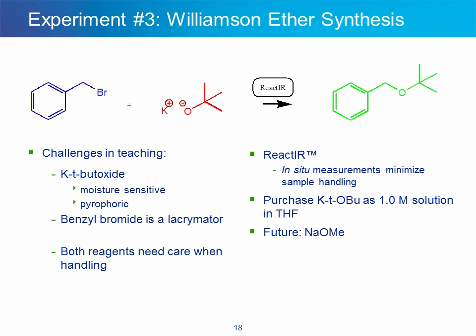Our approach to studying this reaction in the teaching laboratory is by using the ReactIR, because in situ measurements minimize sample handling. In addition, we can minimize sample handling by purchasing solutions of potassium t-butoxide as 1.0 molar solutions in THF. And in the future, we hope to develop this experiment using sodium methoxide, which I think is a better alternative than potassium t-butoxide.